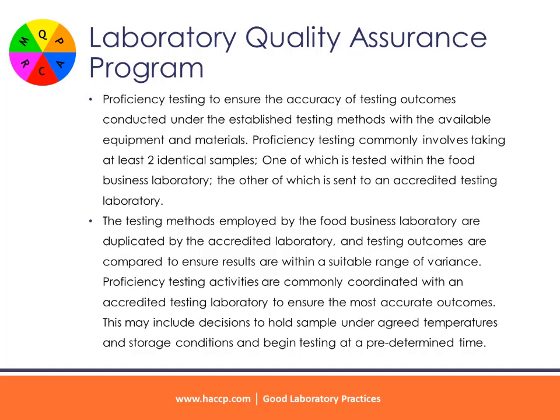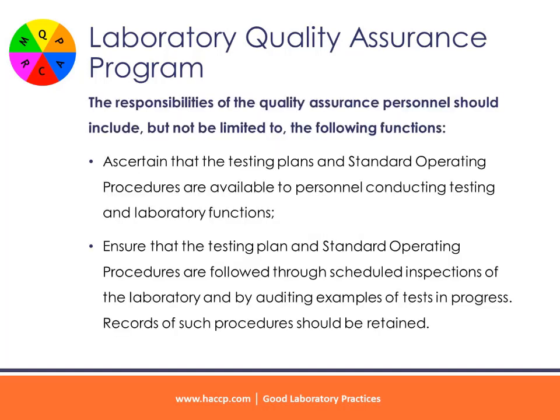Proficiency testing activities are commonly coordinated with an accredited testing laboratory to ensure the most accurate outcomes. This may include decisions to hold samples under agreed temperatures and storage conditions and begin testing at a predetermined time. The responsibilities of the quality assurance personnel should include, but not be limited to, the following functions: ascertain that the testing plans and standard operating procedures are available to personnel conducting testing and laboratory functions.